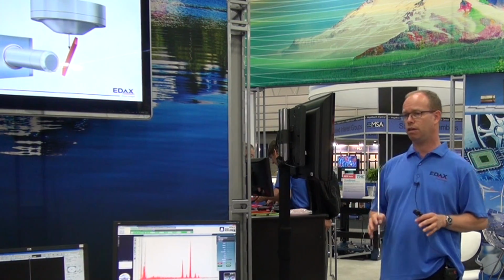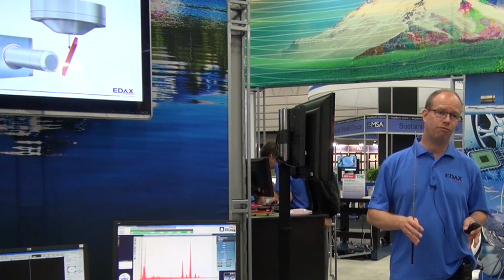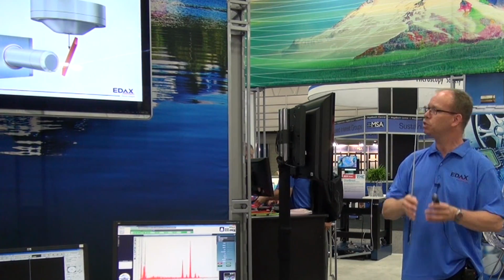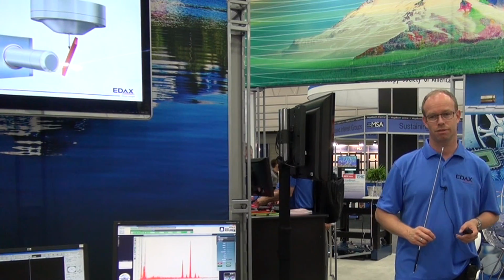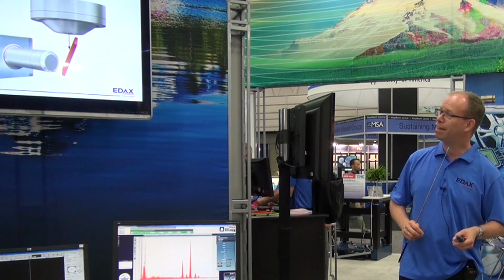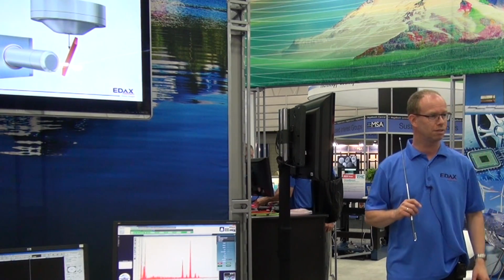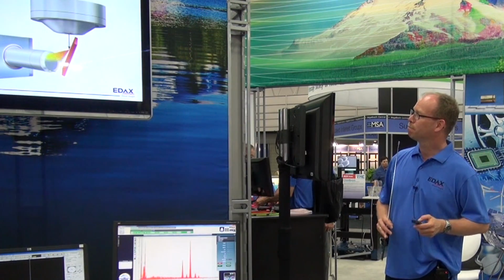It doesn't affect the analytical resolution too much. You can lower the kV to limit the interaction volume, but also there you're limited in what you can still do. And if you're lucky, you can just use heavier materials. But typically none of us have that freedom to just go, I'm only going to work on platinum from now on. Typically you just have to use whatever you're working with.